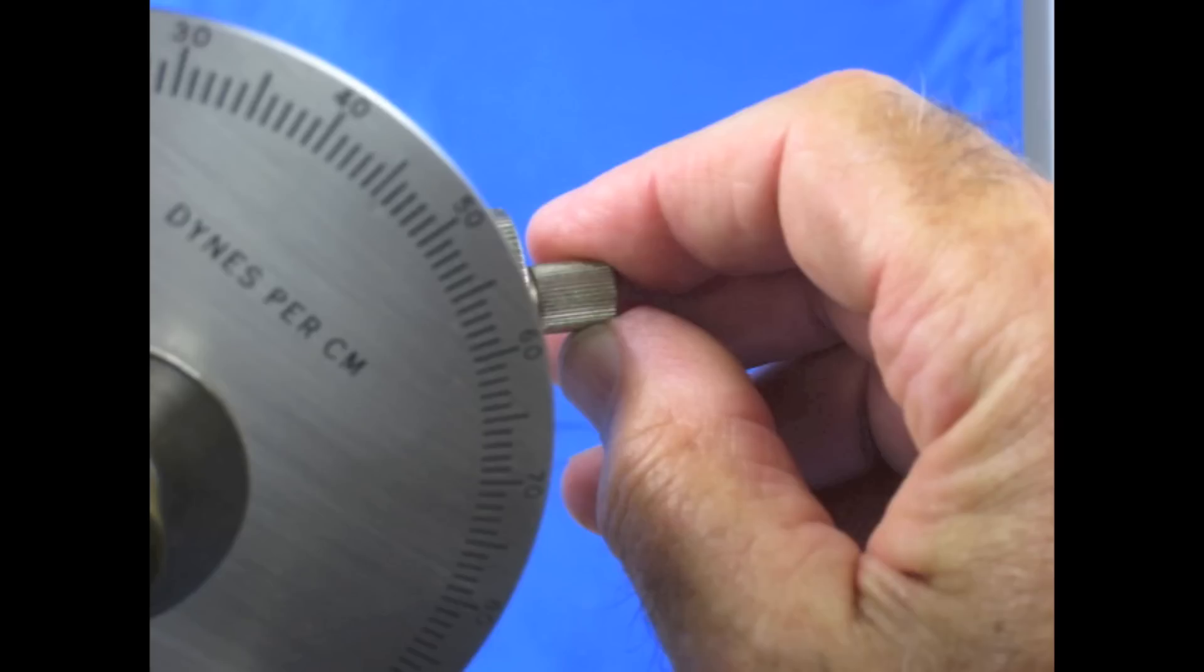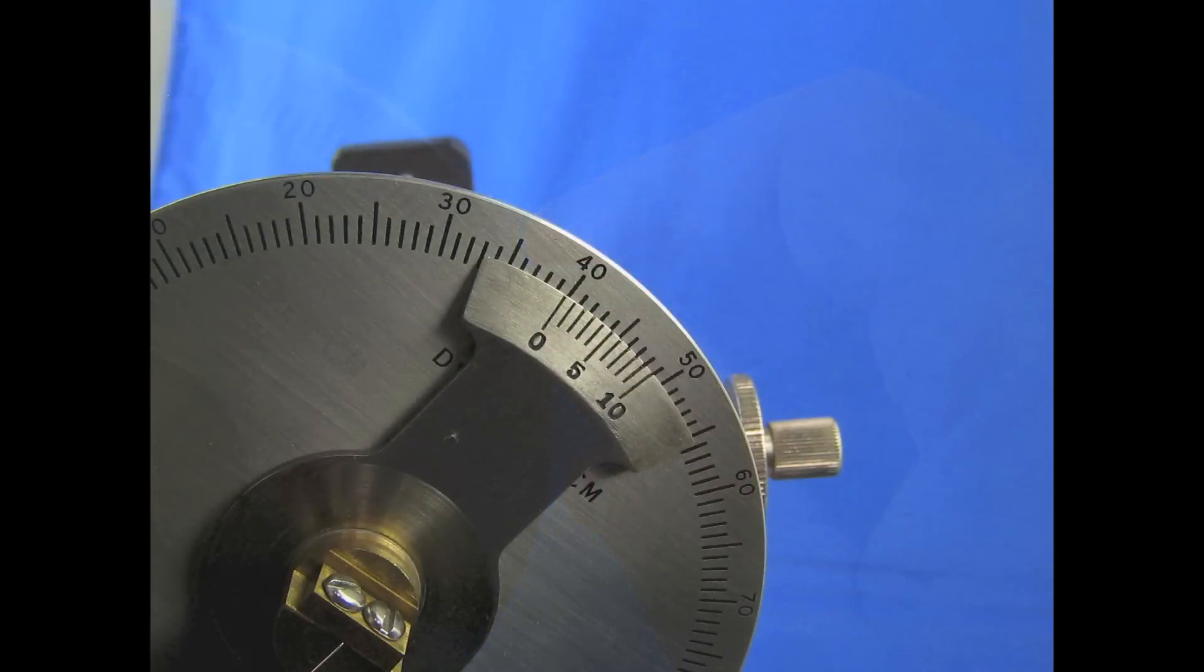Using the adjustment knob, bring the pointer to the line until the dial vernier reading is within 0.5 dynes of the calculated number.